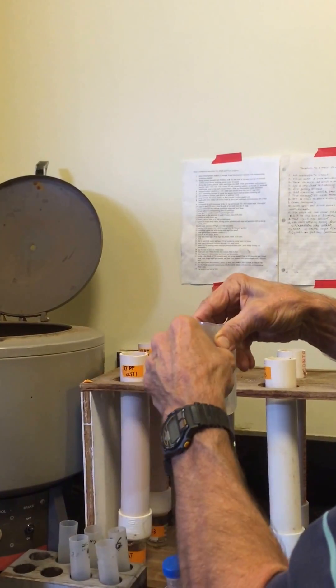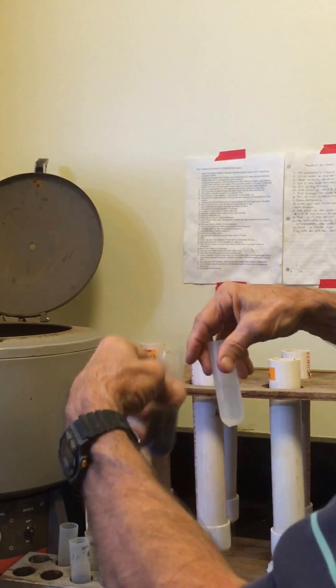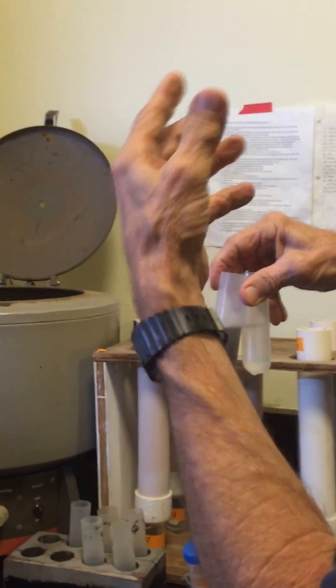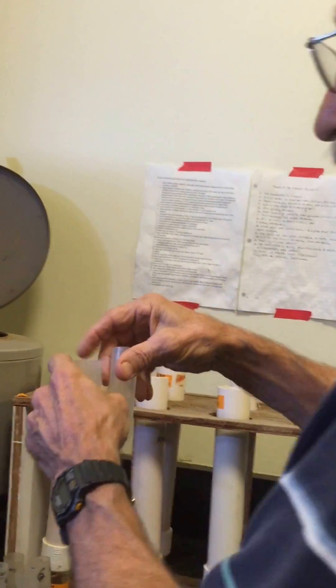Resuspend them and then centrifuge it slowly - slowly enough to pull the particles down but keep the sugar to keep the nematodes floating. So is it saturated sugar? It's one molar sugar.